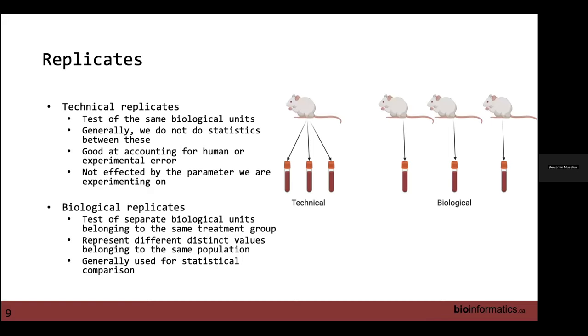I realize I'm jumping around a lot, but there are a lot of different ideas. Again, this was also mentioned by Florence, but it's important when we're talking about statistics as well, and that is the idea of replicates. Florence mentioned 3 types. I have 2 types here, because these are the types we run into most often: technical replicates and biological replicates.